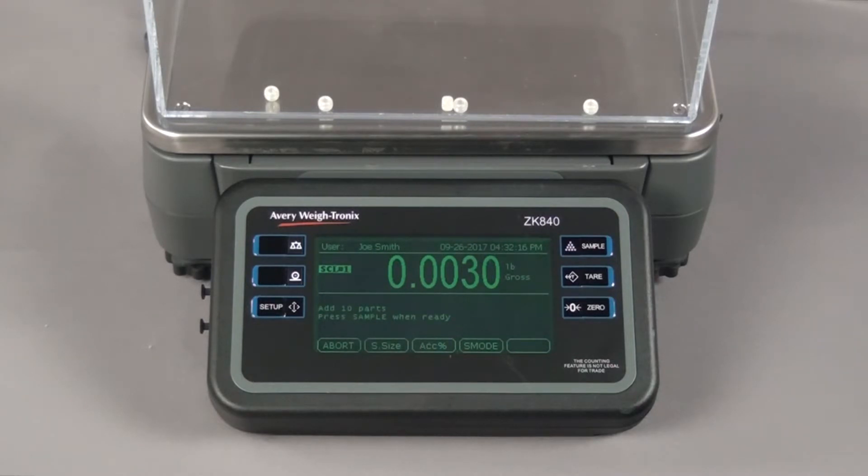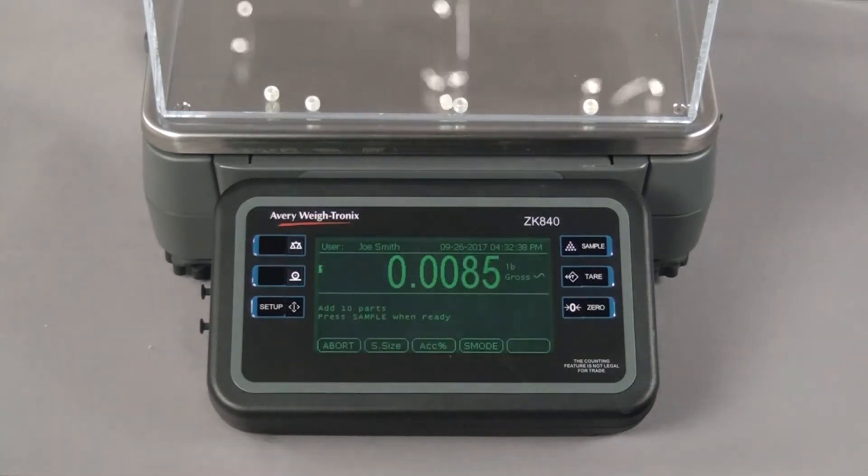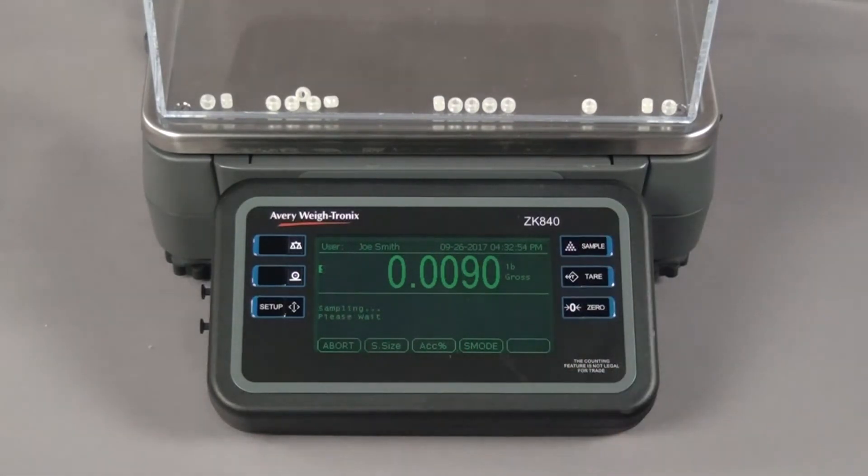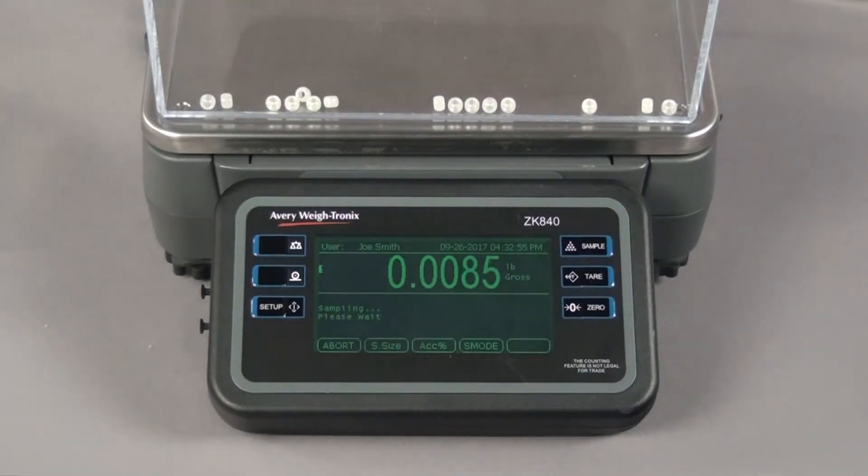In this example, the sample size was not large enough, so the scale prompts us to add more pieces. Add the number of pieces requested and press the sample key. The ZK840 briefly displays the gross weight of the pieces and then the piece count.